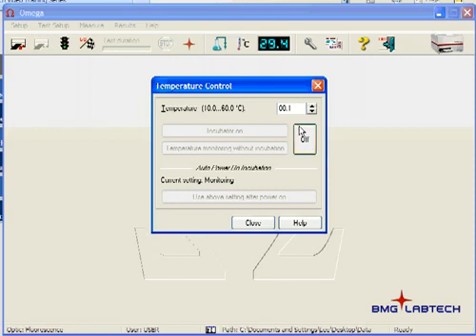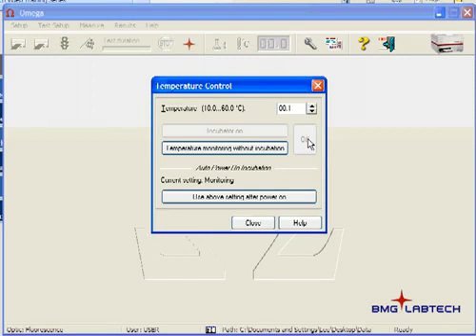If you would like the temperature off, we just click the off button and then it will automatically turn off.